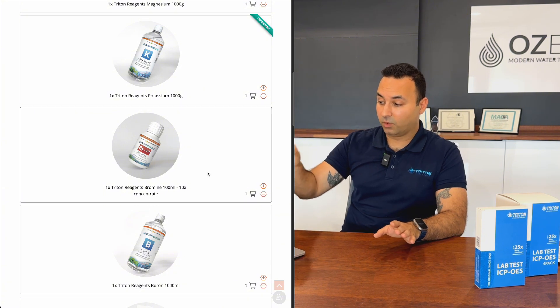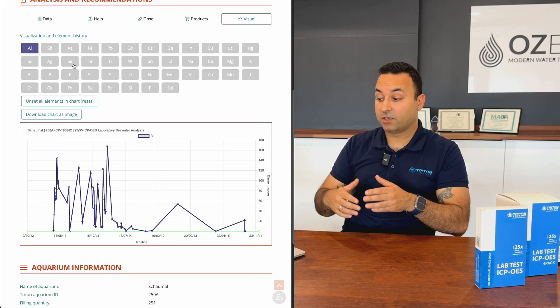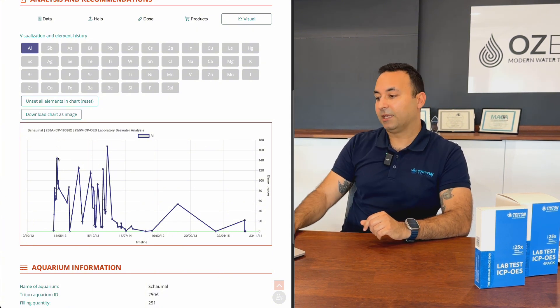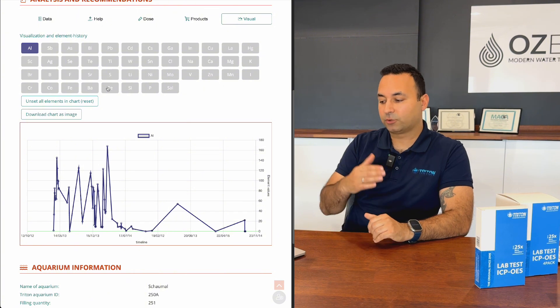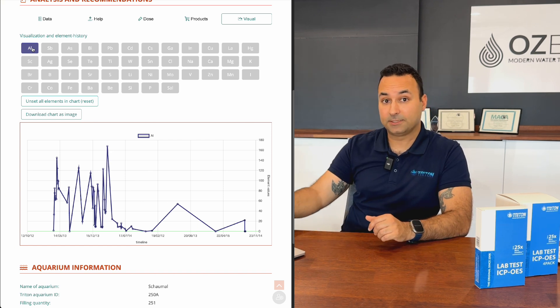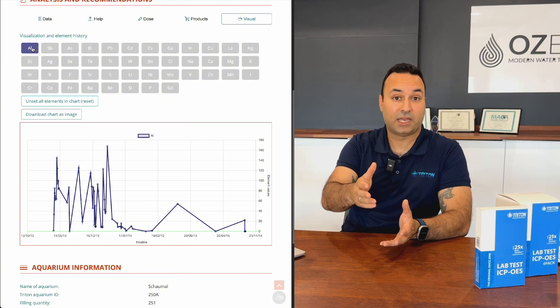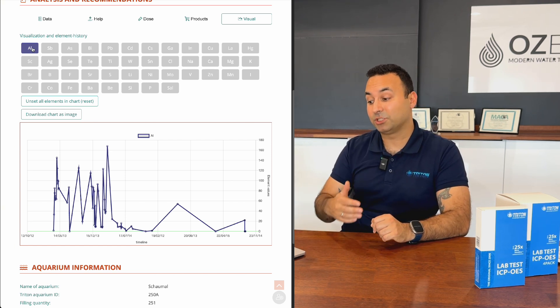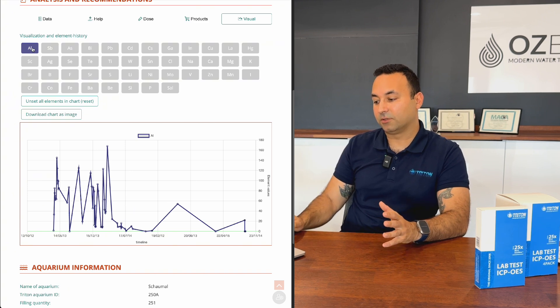The Visual tab is a more advanced feature for customers who have done many tests with us. All past tests are archived and you can select any element to track its trend over time. For example, you can see phosphate dropping from a high level to a low level over six months, or spot if you had a contamination event at a specific point, which is very useful for public aquariums and serious hobbyists.